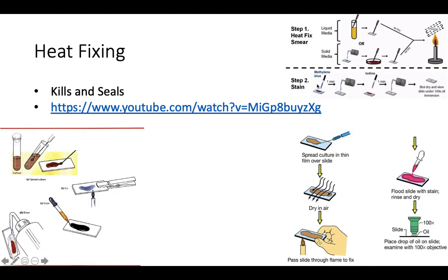Well, if you didn't stick them to the slide, you wouldn't be able to put any stain on them. You'd put liquid stain on them, or water to wash that stain off, different combinations of stain or whatever. And if they weren't permanently stuck to the slide, you'd just wash them away, which would kind of null and void the whole point of trying to stain them. So heat fixing is going to kill them, which is the whole point, so they don't get you sick or get anyone else sick or contaminate anything. And it's going to glue them to the slide.